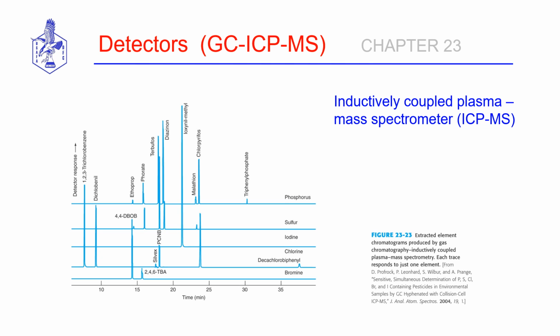And so this combination actually gives us the lowest detection limits possible for all elemental methods of analysis. So these instruments are more expensive. They are more so in the greater than $100,000 cost range, but the more powerful techniques are, the more expensive they become. But obviously you can do a lot more with those instruments.